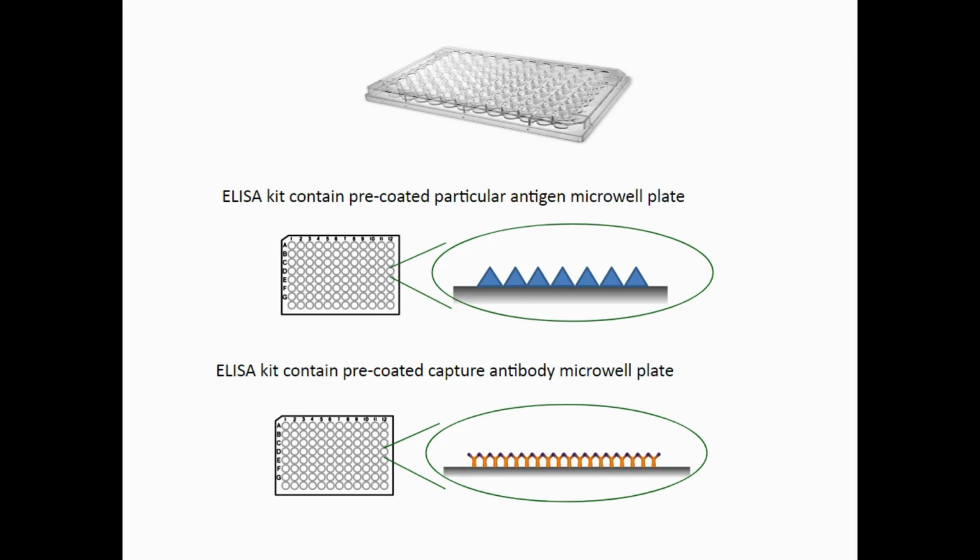What happens is we capture those primary antibodies from human serum, and we inject those primary antibodies into the animal host. For that animal host, those primary antibodies act as antigens, because for that animal species, that antibody is basically a pathogen, or a foreign object, or an antigen.